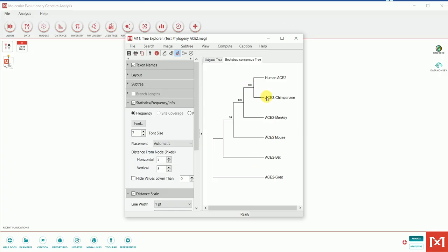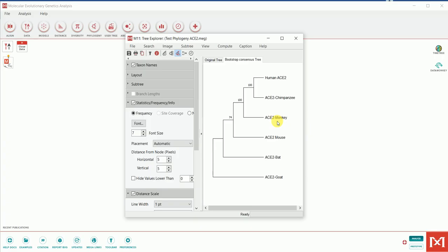From this tree, we can see that ACE2 from monkey, chimpanzee, and human are clustered together in one clade with high bootstrap confidence. This indicates that the function of ACE2 in humans, chimpanzees, and monkeys may be similar. From phylogenetic analysis you can not only study evolutionary relationships but also infer the functional similarity of a protein across species. If you know the function of ACE2 in humans, you can infer its likely function in chimpanzees and monkeys. I hope this video was helpful — thank you very much for your support.